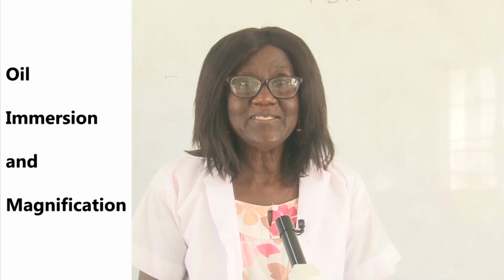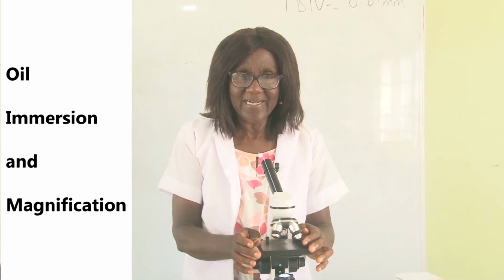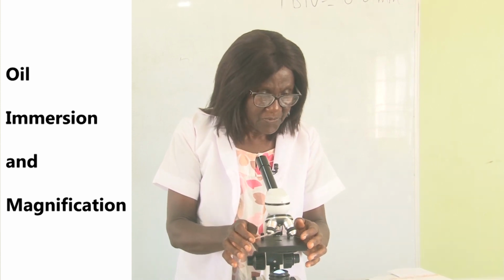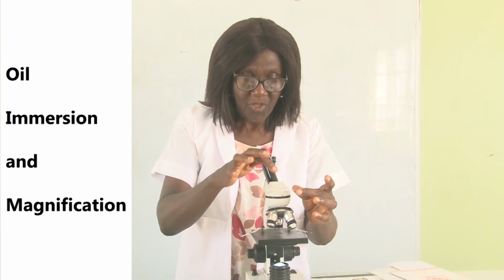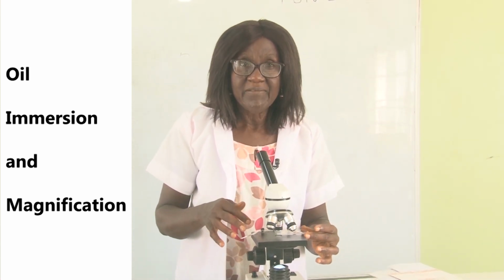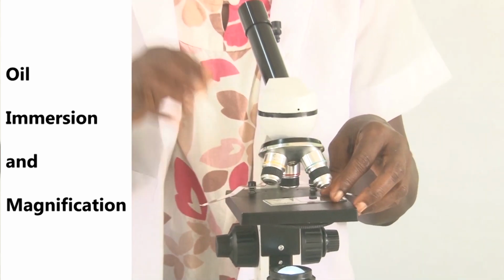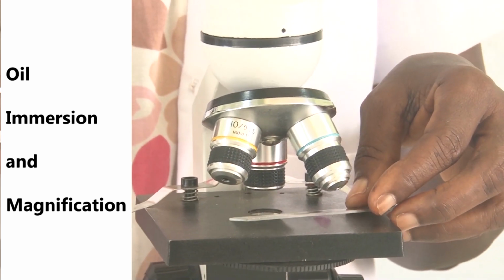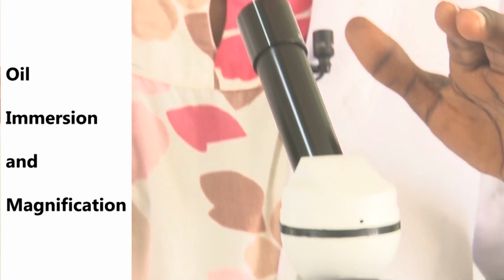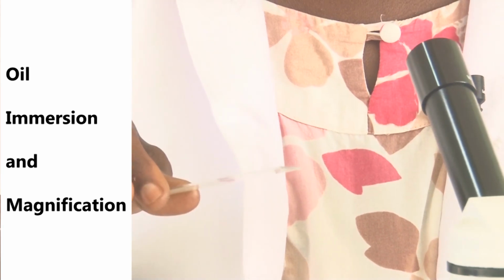Let's look at our next topic. It's on oil immersion and magnification. Now let's look at oil immersion and microscope work. Oil immersion is simply putting a special type of oil on a microscope slide so that you can use the high power lens to look at the specimen very clearly. All right? So just to have a very clear view of the specimen under high power.